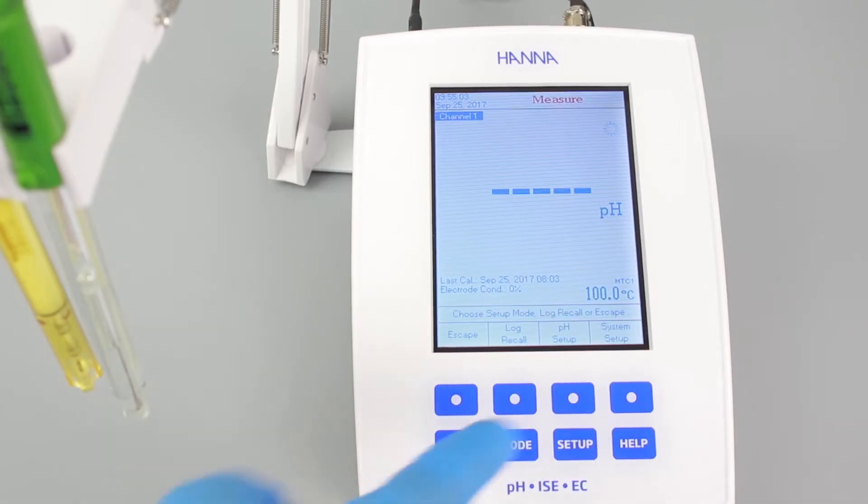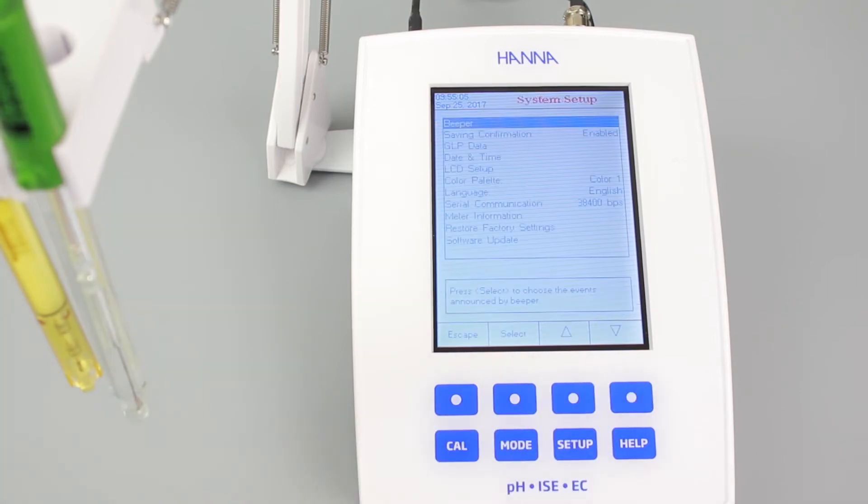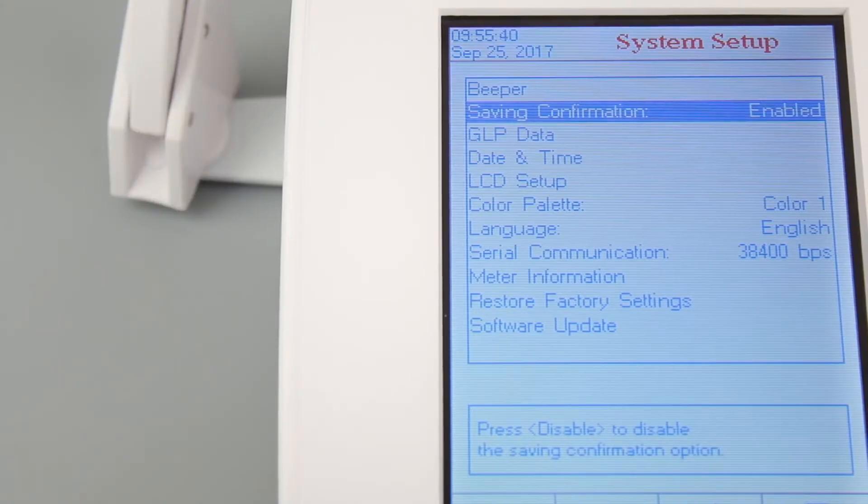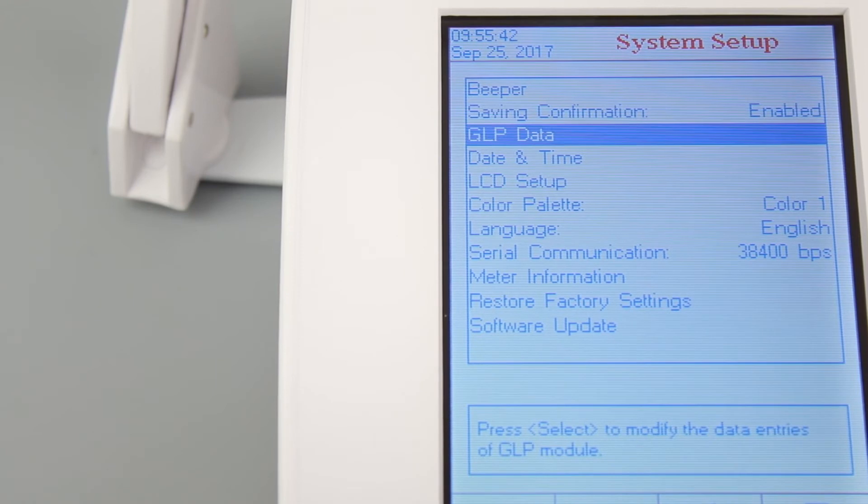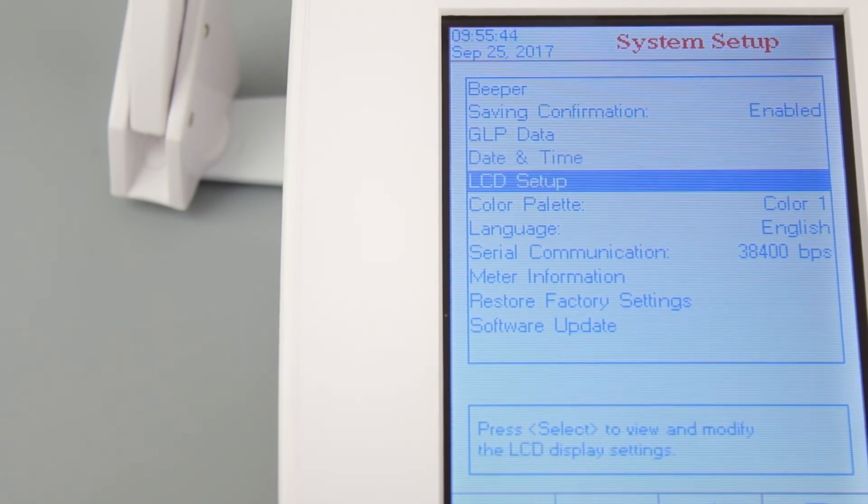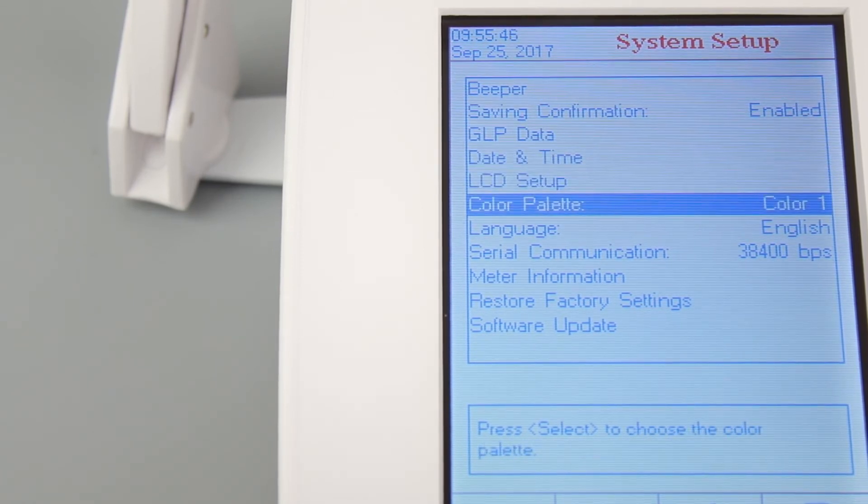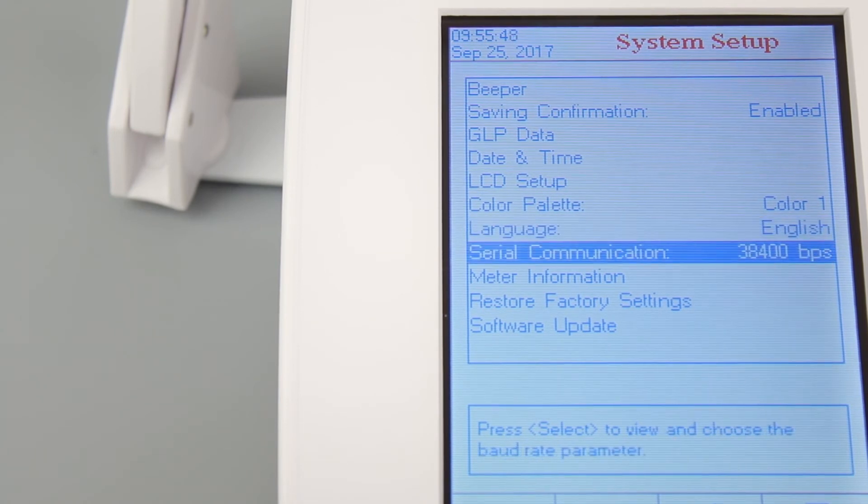Once the meter is on, you'll find that there are many different options to choose from. We recommend starting with the system setup. Press the setup button and then system setup. This area of the menu lets you set the date and time, GLP data, and LCD settings. You can also view information about your meter and other operational preferences that you can set to your liking.